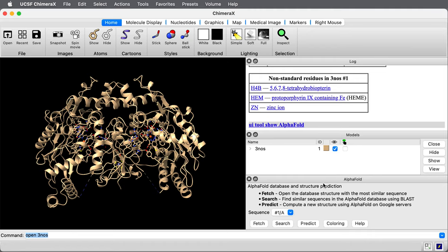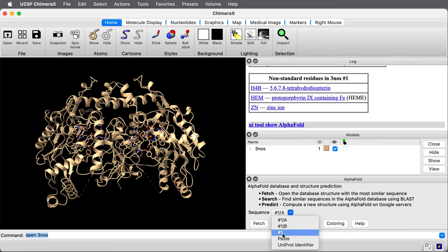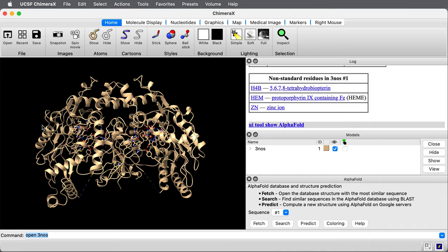It brought up this panel and I choose the sequence that I want to fetch the structure for. I could paste a sequence or use a uniprot identifier or it can just use the sequence from the experimental structure. I'll choose the experimental structure two chains A and B.